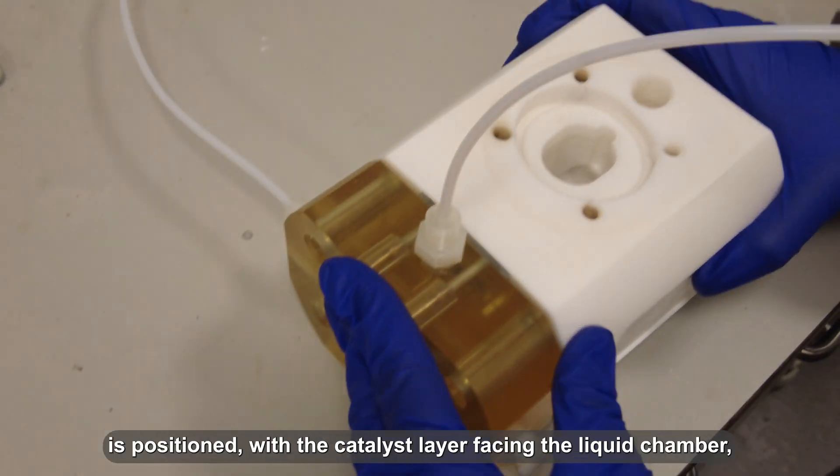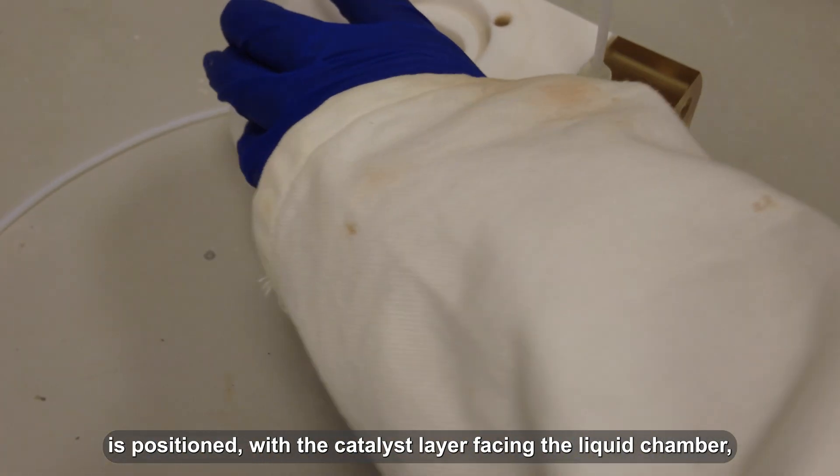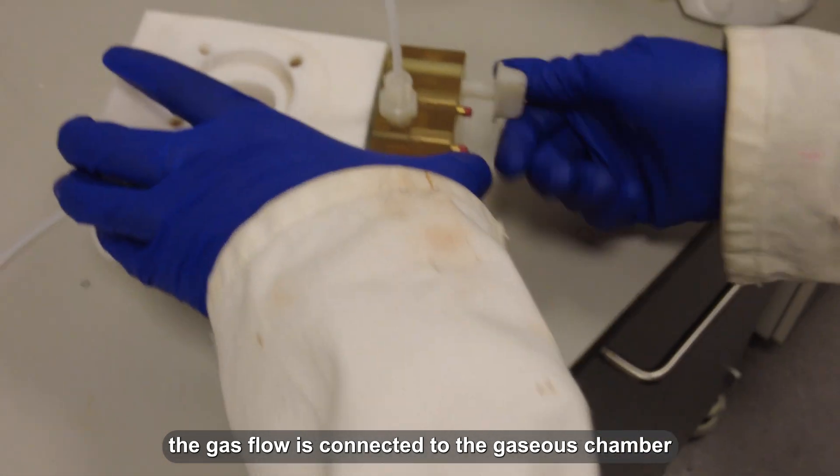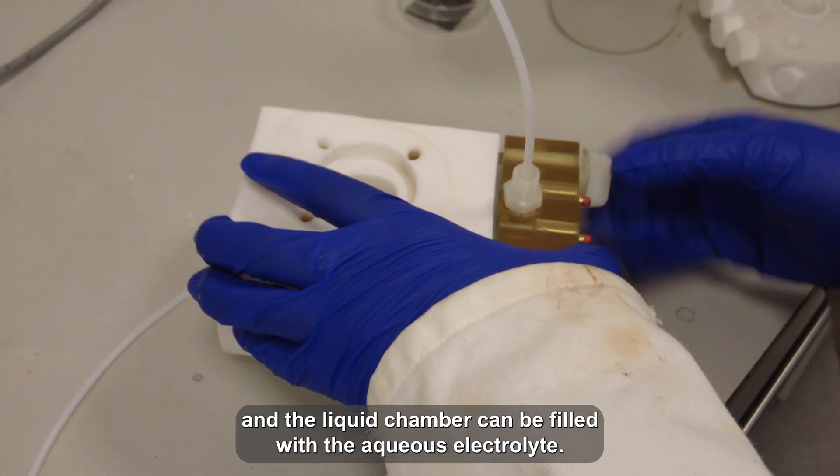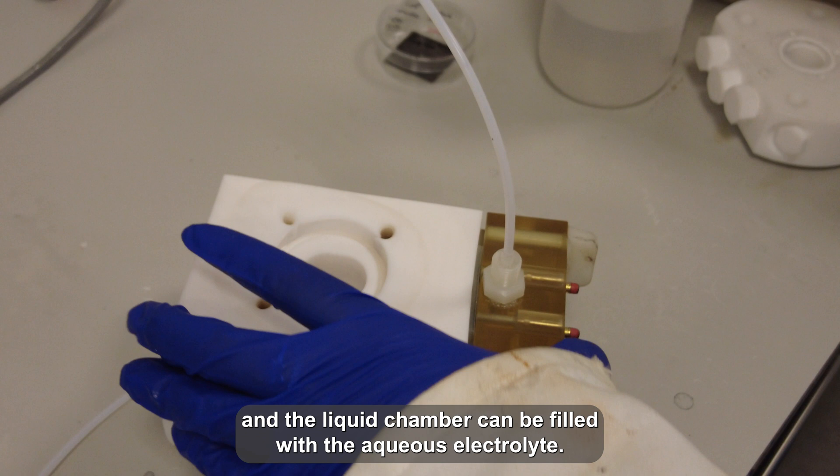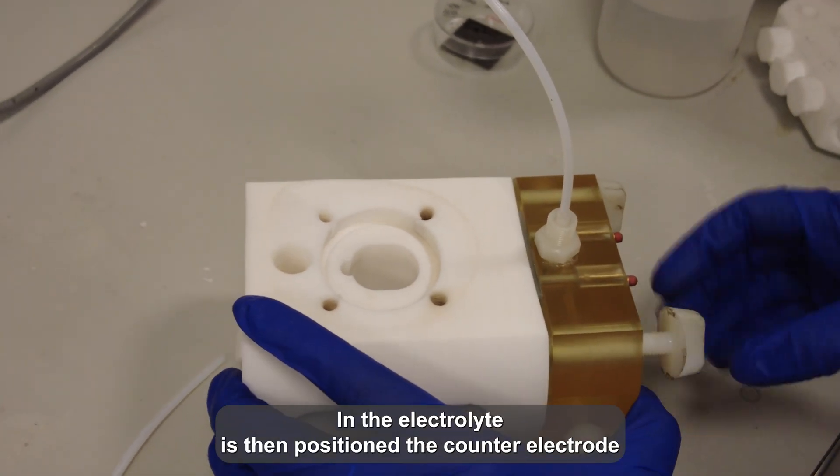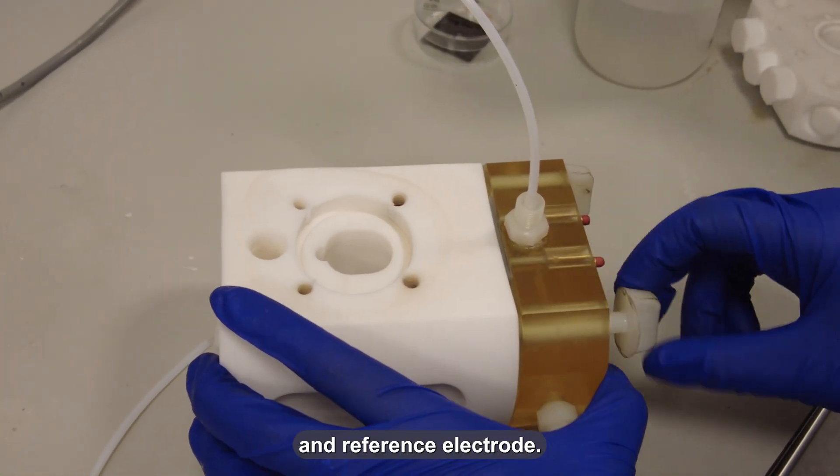Once the working electrode is positioned with the catalyst layer facing the liquid chamber, the gas flow is connected to the gas chamber and the liquid chamber can be filled with aqueous electrolyte. In the electrolyte, we then position the counter electrode and the reference electrode.